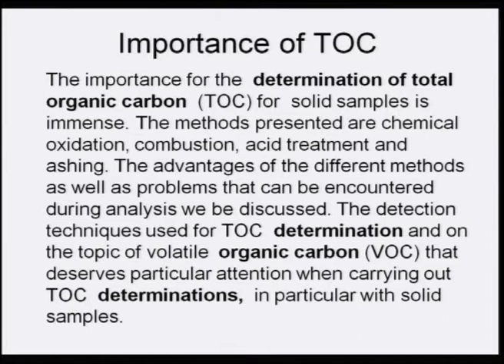The advantages of different methods as well as problems that can be encountered during analysis will all be discussed here. The detection technique used for TOC determination, and the topic of volatile organic carbon, that is the VOC, deserve particular attention when carrying out the TOC determination, in particular with solid samples.